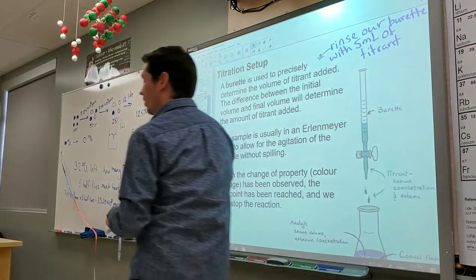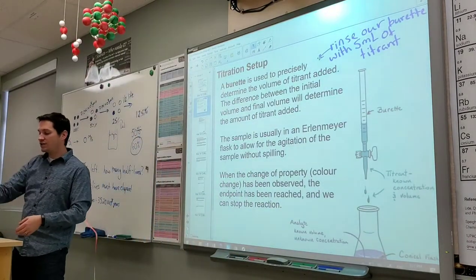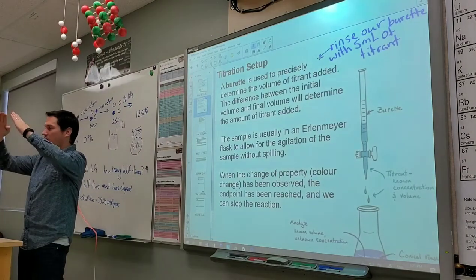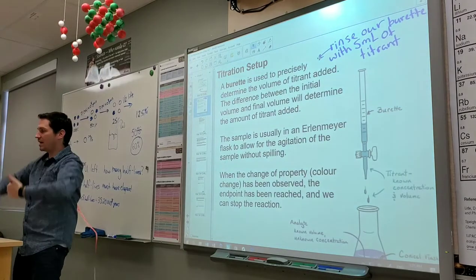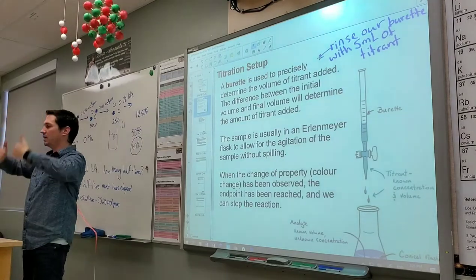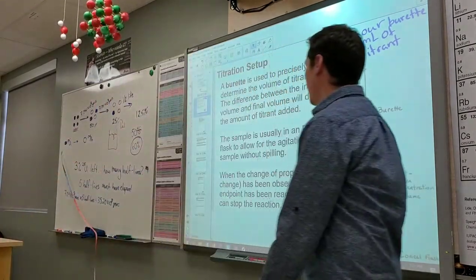So it doesn't spill out. Also, as you're adding the titrant, it's going to splash up. The sides of the conical flask you're using help prevent that splash from leaving. But if you had a beaker, it might be able to leave. So it's good to have an Erlenmeyer flask.